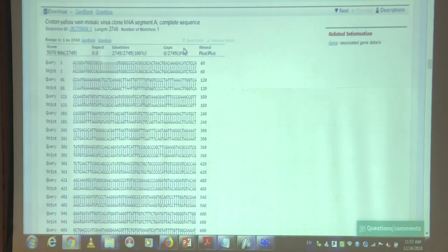They may be the same sequence, but when you make a tree, they fall into two clusters. You have to be very careful. What you are selecting should be uniform, not only in length but also in orientation. Here you just see. Is that clear to all of you?